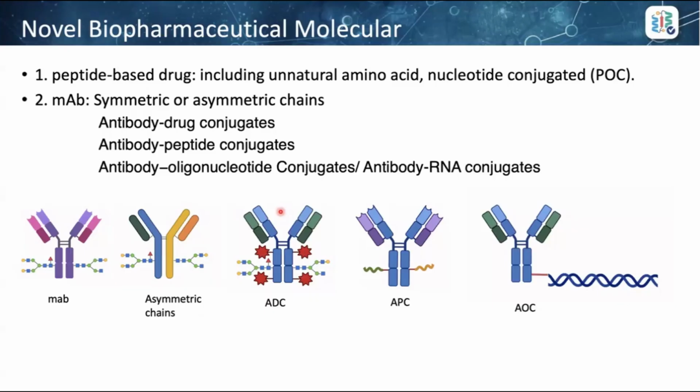So ProteoformX supports the analysis of these next generation biological molecules.